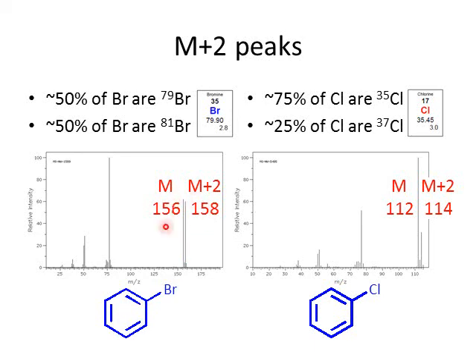And in the mass spec, notice that I see 2 signals, the M and what's called the M+2, the molecular ion for the smaller isotope of bromine, and the molecular ion for the heavier isotope, that are of roughly equal size, 2 atomic mass units apart. Notice there's also smaller blips here for M+1 and M+3. Those are for the presence of carbon-13. So if you've got 5 carbon-12s, 1 carbon-13, and a bromine 79, you'll get the M+1. If you have 5 carbon-12s, 1 carbon-13, and the bromine 81, you get this M+3.